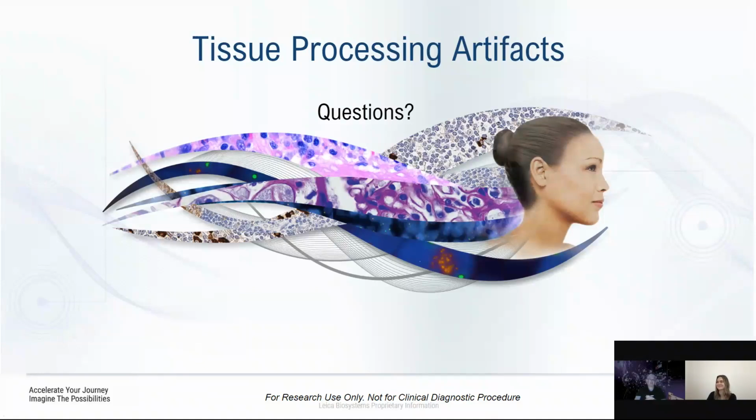If perfusion would be ideal too for organs that you want to keep intact, just do it as quickly as possible. But remember, do not put a lot of pressure behind the fluid, because then you're going to start disruption from the force of that fluid trying to make its way through everything, especially lung that is so delicate. All right, I hope that helps. Hope that's the answer, or at least some direction and information that will help them get to where they're trying to go.